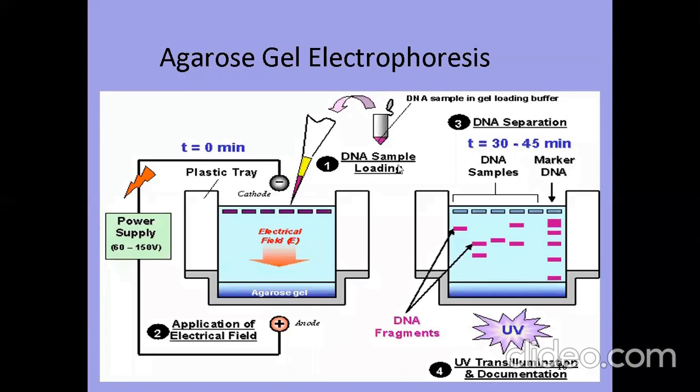And next, when the power is supplied, after 30 or 45 minutes we will visualize bands, DNA fragments, if we check under UV light.